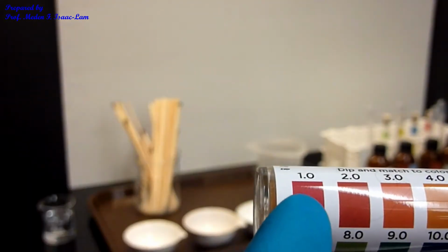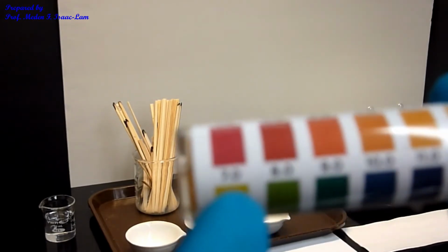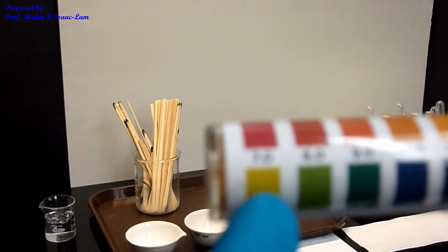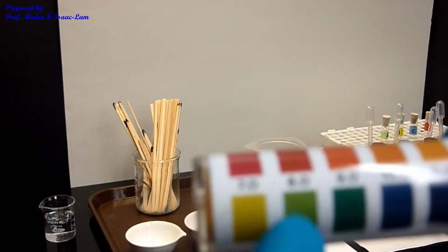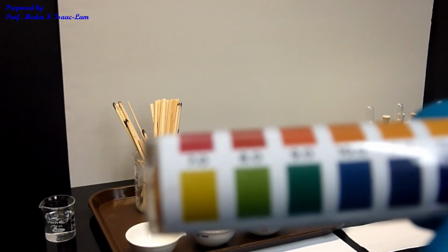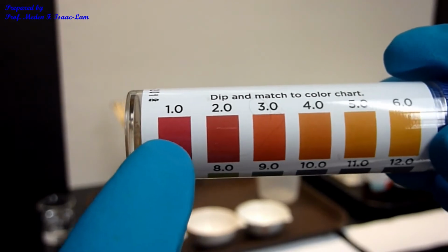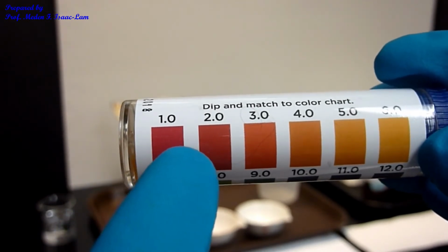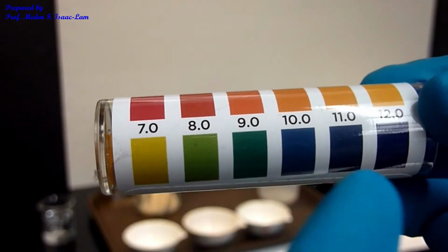So the more red it is, the more acidic the sample. And then 7 is yellowish, yellow-green, and if it's blue, it's basic. So this is the scale. All right, and then we are going to compare the color with the scale.